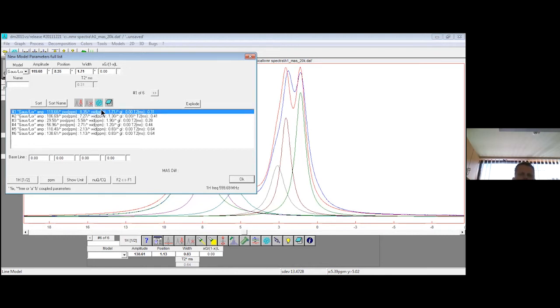So if I change back now, I see, okay, this is bold now. But at the moment, I don't want it to be fit, so I put a space in here. If I would want some other parameter to be fixed, then I would put a space instead of an asterisk.